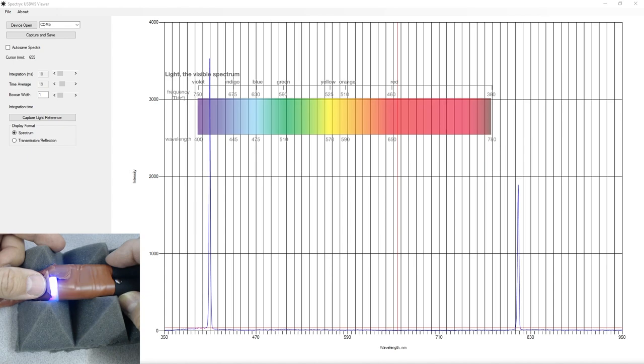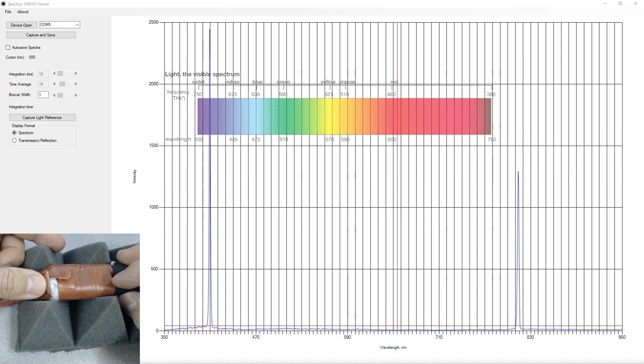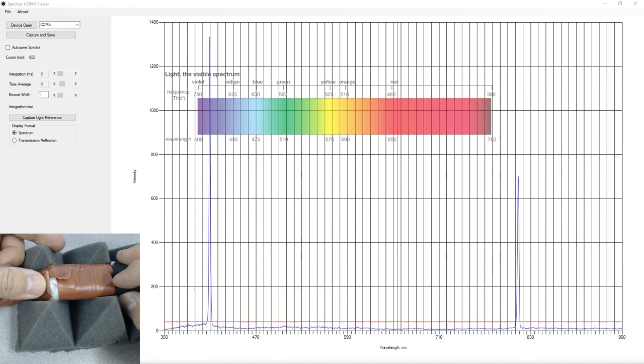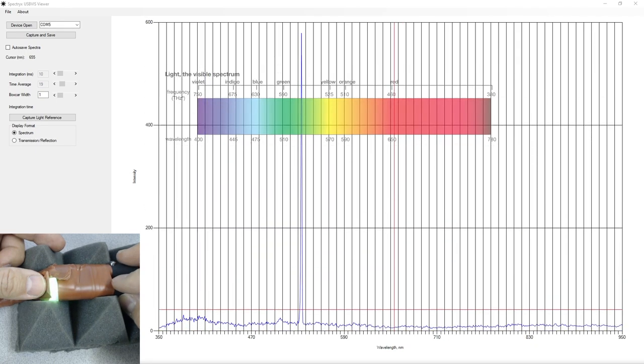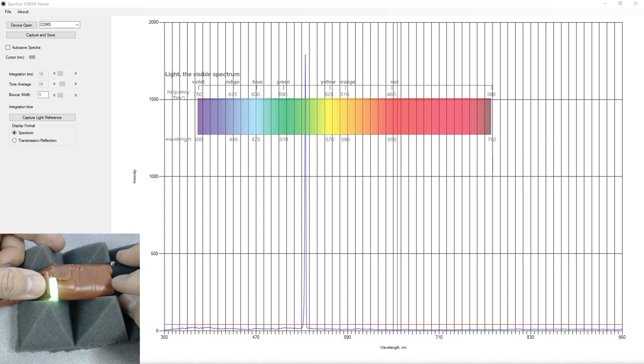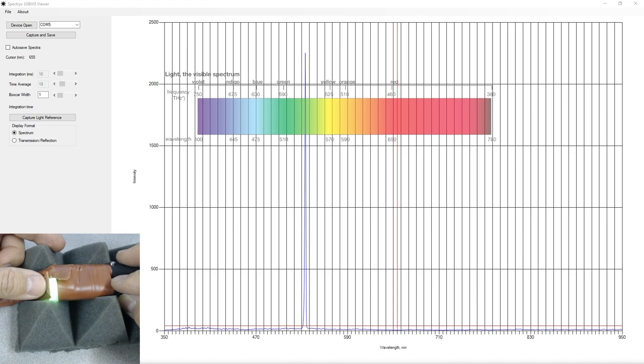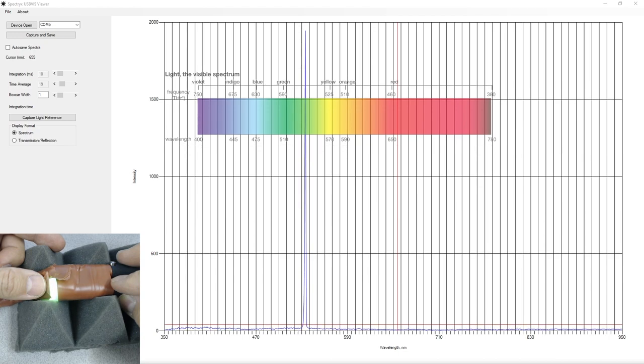And you can see it's rock solid. I'm going to try and turn on the green next. And you can see, bang, that goes right in there. And that really is green. Okay, and it clips at 8,000. So I'm trying to keep these under 8,000. And what I will do is I will record the group spectrum. And it seems to be pretty rock solid. It doesn't move around. I've tried this quite a long time holding the laser pointer on.